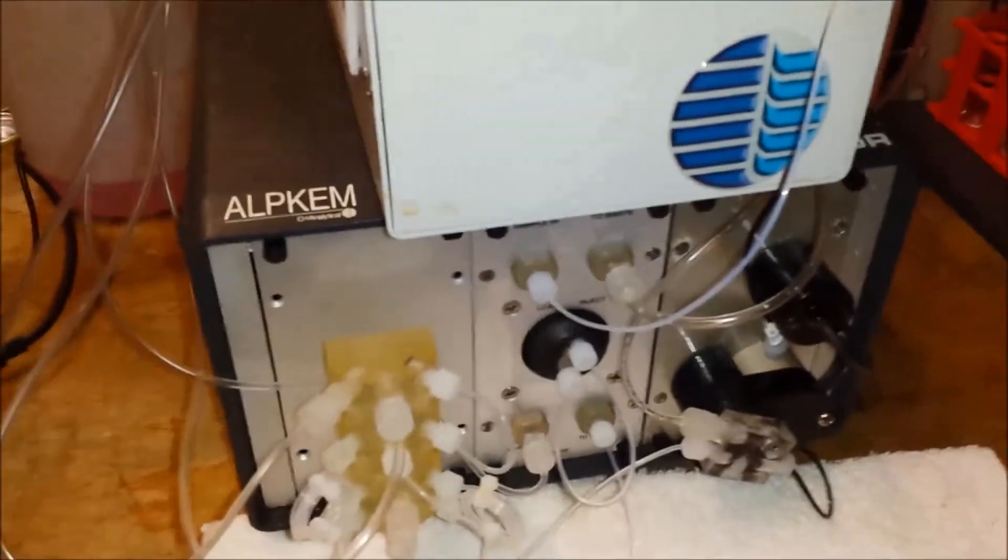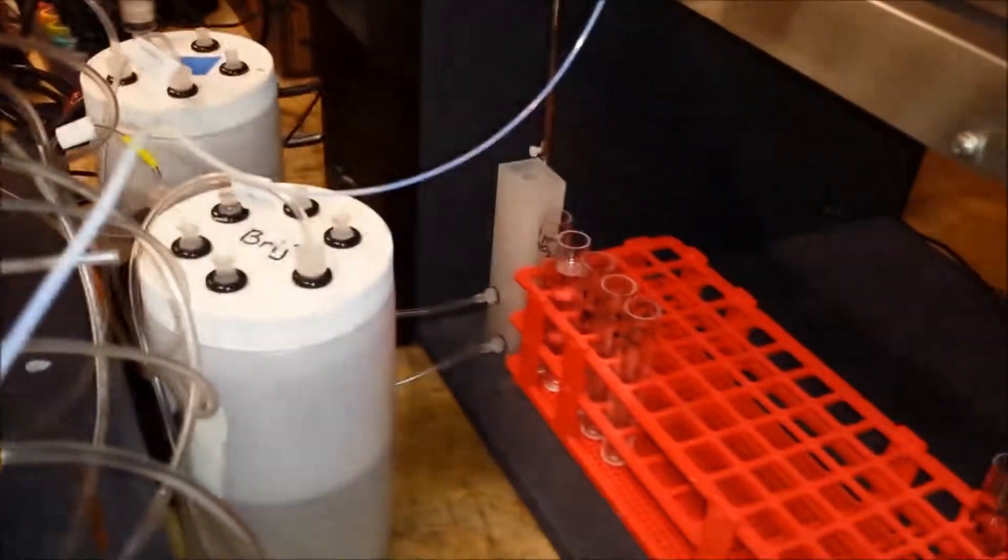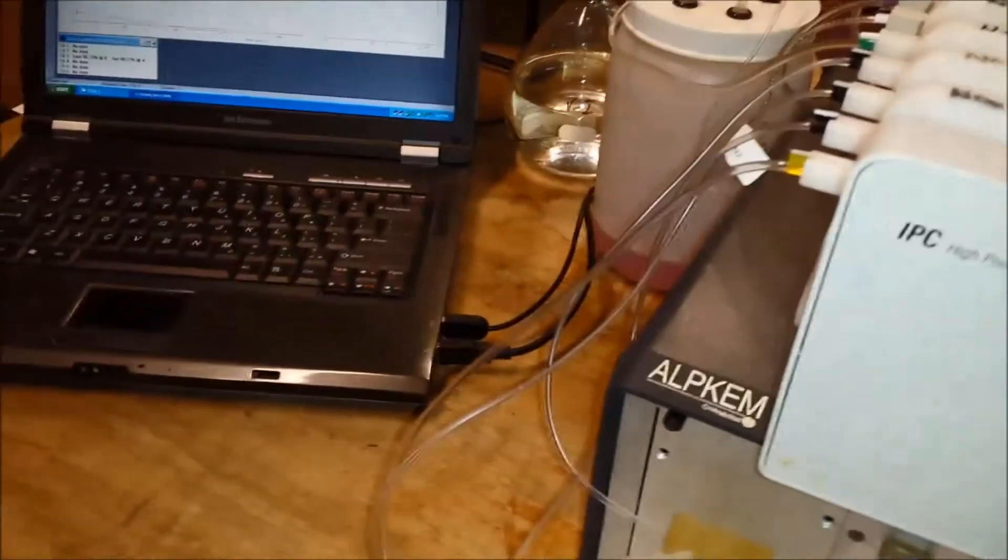The next step would be to make sure in the case of a FIA system that the loop is actually injecting into the system. And in order to do that, you simply remove the vial from the sample table, and then you hit start.